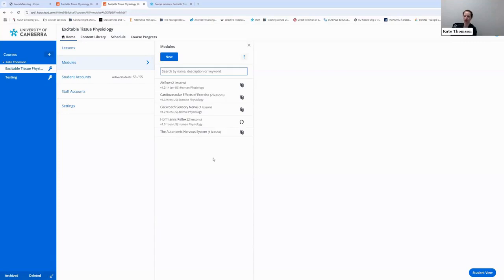That is one of those things that's limited by how many light meter pods you have. At the moment, since we only have one, we have to keep it as a demo system. I'm wondering if there's a potential way to do a relatively crude one, just by putting the sampling rate into the machine of when a trigger would fire, so they can do a sort of pseudo VEP. The latencies would probably be a bit off, but it would give them the general principles before going into more intense ones with the actual light meter pod. If something like that's available, that would be quite helpful.